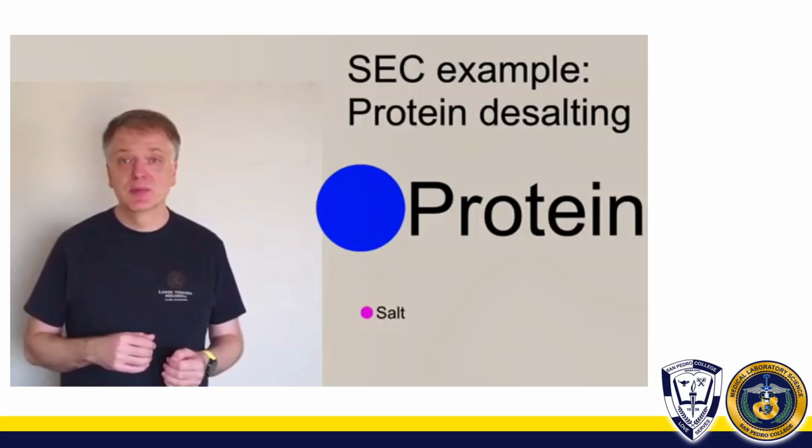Adsorption is interaction, adherence or affinity, but with size exclusion, there is no affinity, as emphasized in the video, no interaction happening. We are just looking at the size, so we can control the entry or exit from the column based on what fits in the bead.